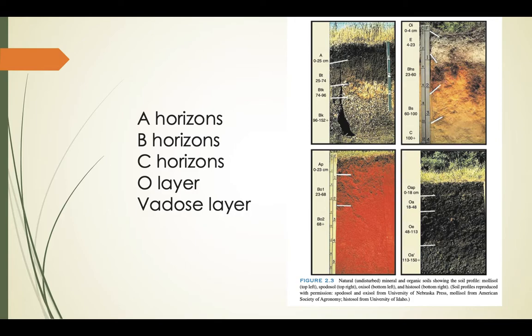Normally, the uppermost layers in mineral soils are the ones most altered during the soil formation process, while the deeper layers, on the other hand, hold the original parent material that is normally unaltered. For organic matter soil, like this very dark colored soil, I think this one is also organic matter. You can see the growth of plants on the topsoil part.